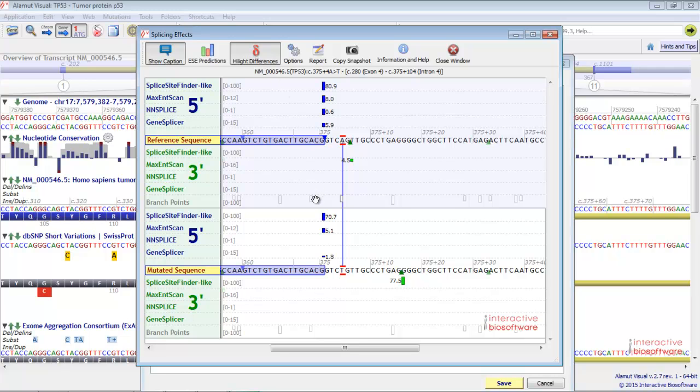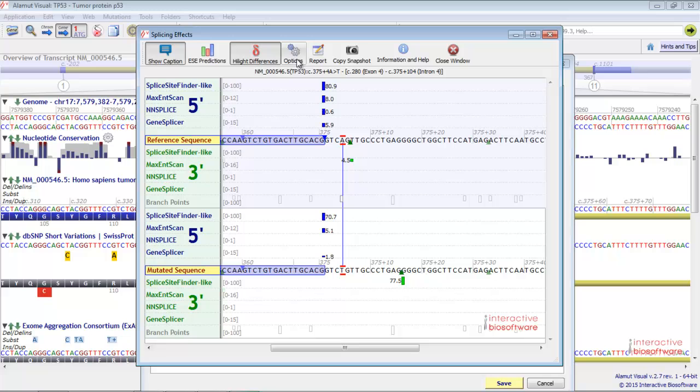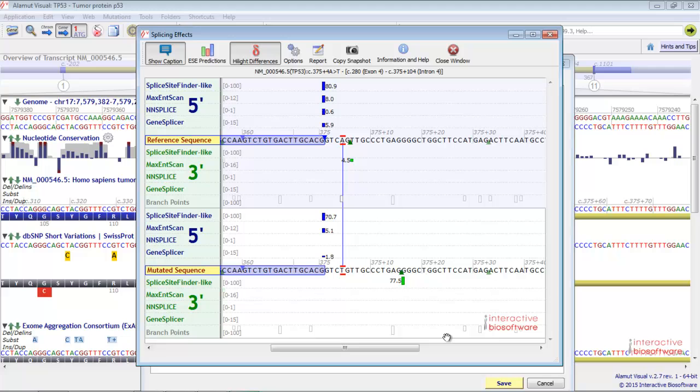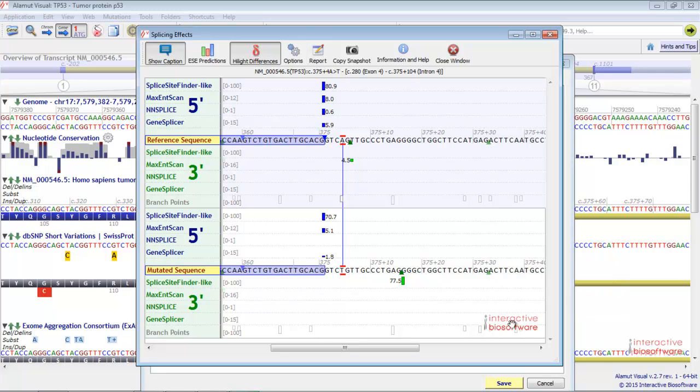We can see that the predictions at the splicing junction are reduced. This suggests that this variant alters splicing. Finally, you have here the splicing predictions option settings. You can also generate a report clicking this button. Let's go back to the main screen.